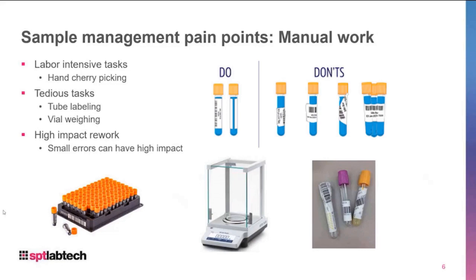And feeding on the last line here, there are places where there's really high impact to mistakes in these processes. Transitioning the wrong tube can lead to poor run starts or batch processes. So definitely important to be consistent and to try to maintain a sense of focus.